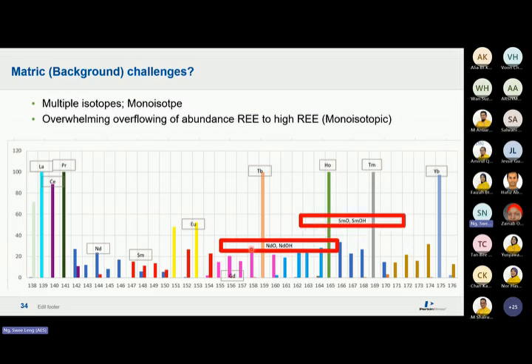So samarium, you see, is the red color one. Samarium has so many isotopes. As long as samarium combines with oxygen, it will come as heavy interference to the heavy rare earth. So you see in the heavy rare earth, we got four elements. It's very poor thing, because sometimes when you have overlapping, you can run away, like just now with the ICP-OES. If this wavelength overlaps with me, I can use another wavelength.